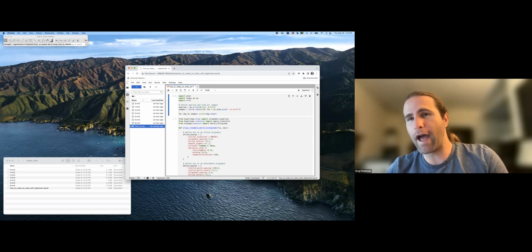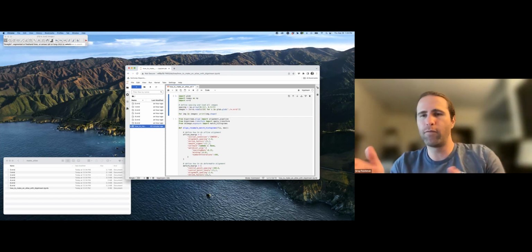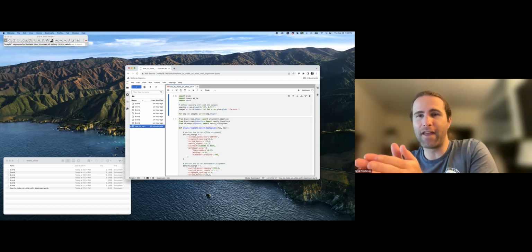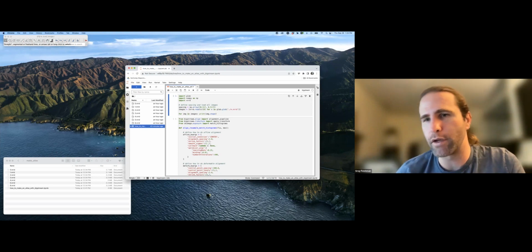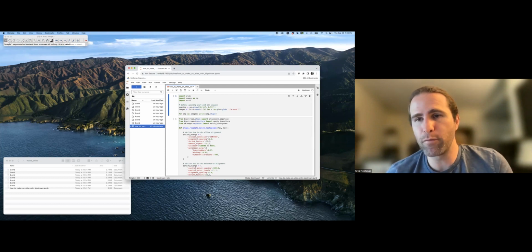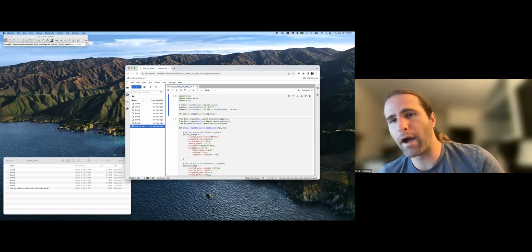I think they do that because they resolve this quantization problem that you've mentioned by taking, say, a bin, all the voxels that are value 100, and splitting that and stretching it over multiple floating point values in order to keep the image looking smooth. I typically allow the algorithm to do that, and then I round. But that's an important point, that you could subtly change the characteristics of some of your data by histogram matching.